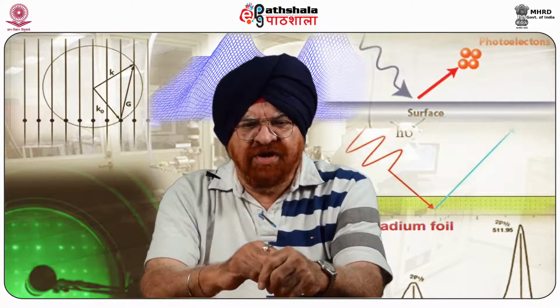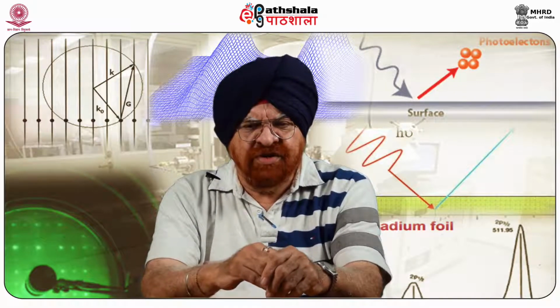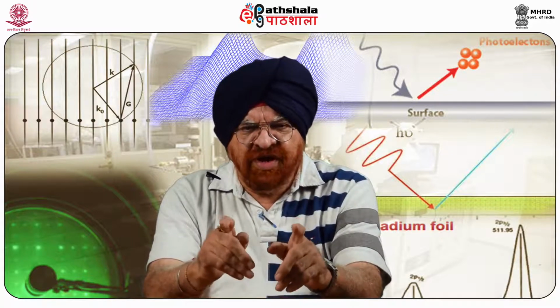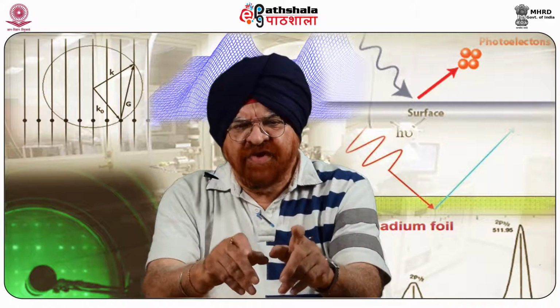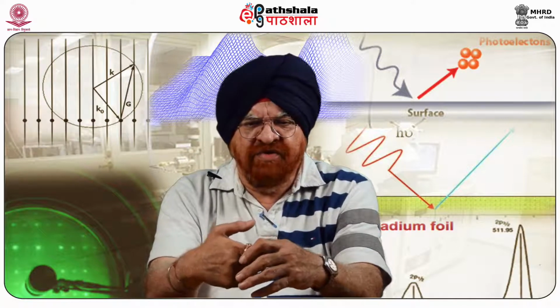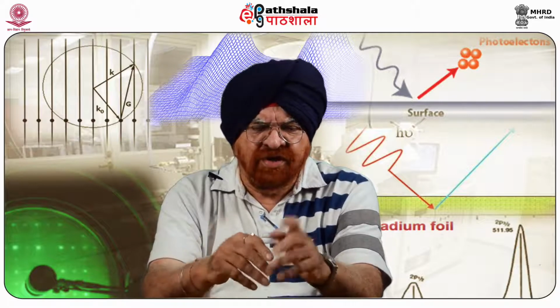XPS requires ultra high vacuum conditions for proper operation. That is why we always say that if the vacuum lining is not proper, vacuum may leak and you will never ever be able to get the correct results.